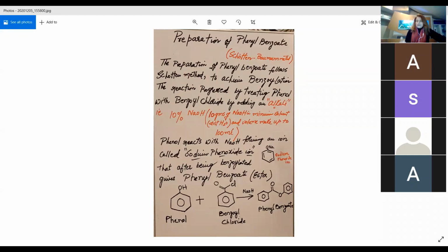And then rinsed with, of course, the solvent. You know which solvent, because every time you have to see in the scheme which solvent they are using. So you have to rinse your glassware with that particular solvent, right? You have to see the medium of the solvent. Here, they are using distilled water, benzoyl chloride is also there, and then for recrystallization they have recommended ethanol. So you can rinse with ethanol, no problem.